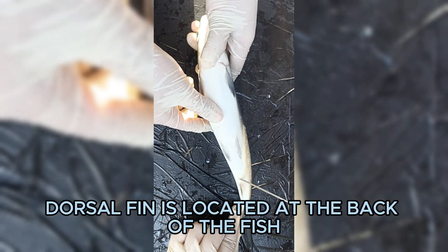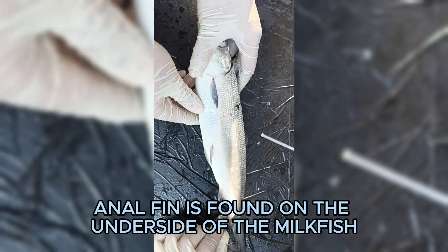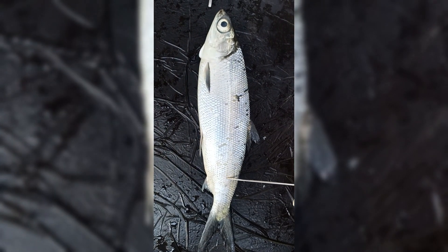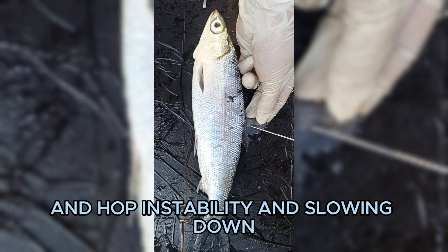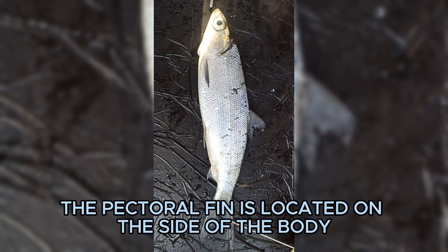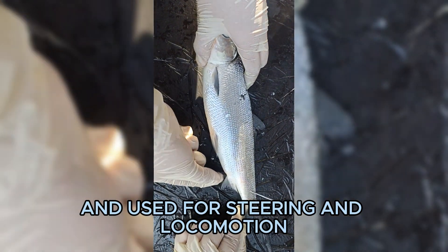The dorsal fin is located at the back of the fish and helps with balance during swimming. The anal fin is found on the underside of the milkfish and helps keep a fish upright when turning abruptly. The pelvic fin is located behind the pectoral fins, helps in stability and slowing down, and is used for moving upward and downward.